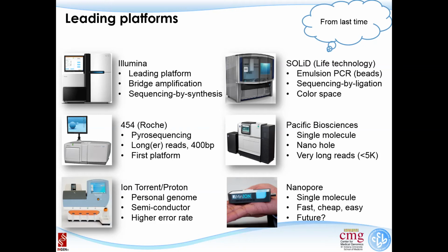The third one we talked about briefly was the 454 sequencer, which was later purchased by Roche. But this was the first ever commercially available next generation sequencing instrument. It came to the market in 2006, so 12 years ago. I think Illumina was 2007, and SOLiD was 2008. So that is more of a historical thing, but they do have longer reads, and they were based on a pyrosequencing instrument.